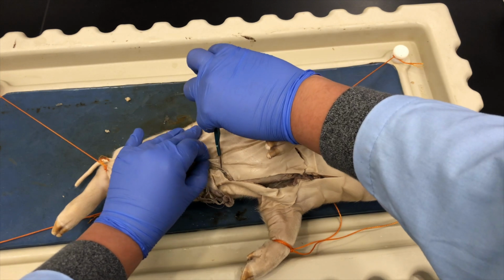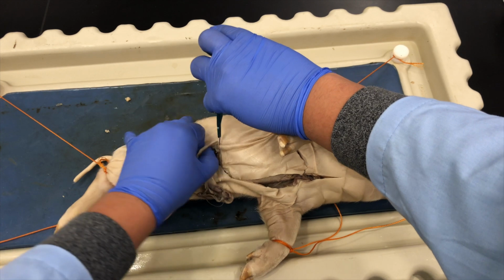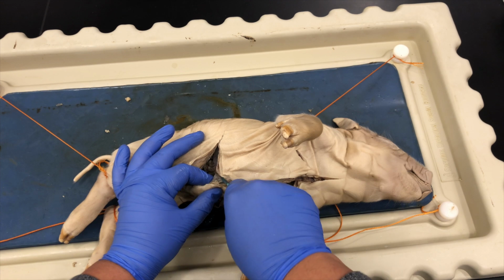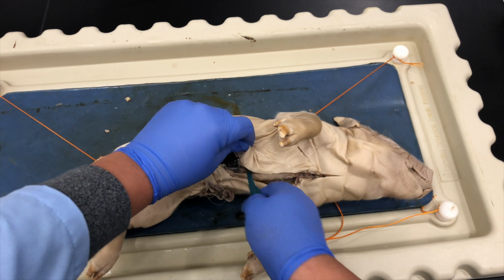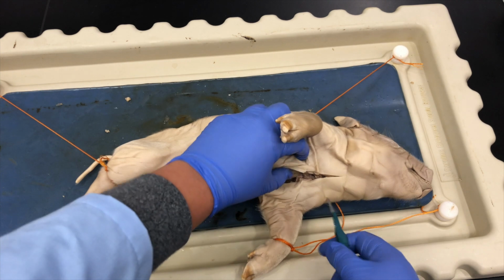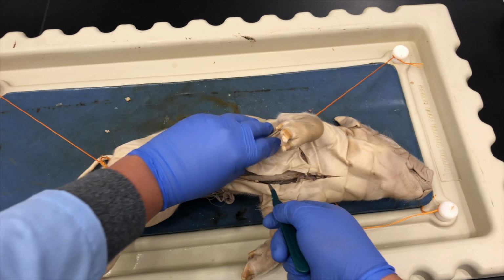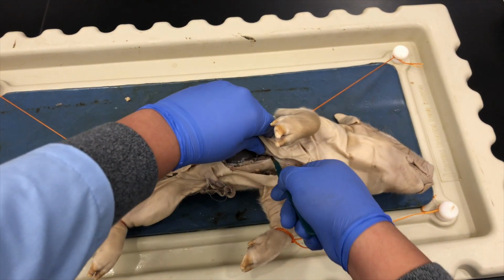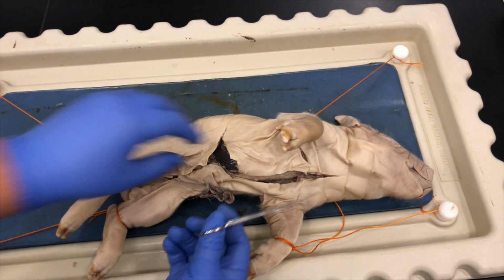The next incision would be towards the front of the hind limb. It would be from the initial incision around the umbilical cord. With these cuts, I was able to get a better grip of the skin and begin to make the final cut so that I can pull it away and create sort of a flap.